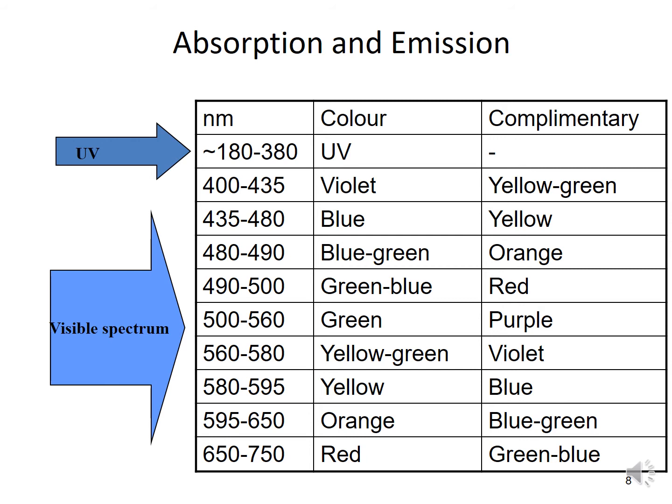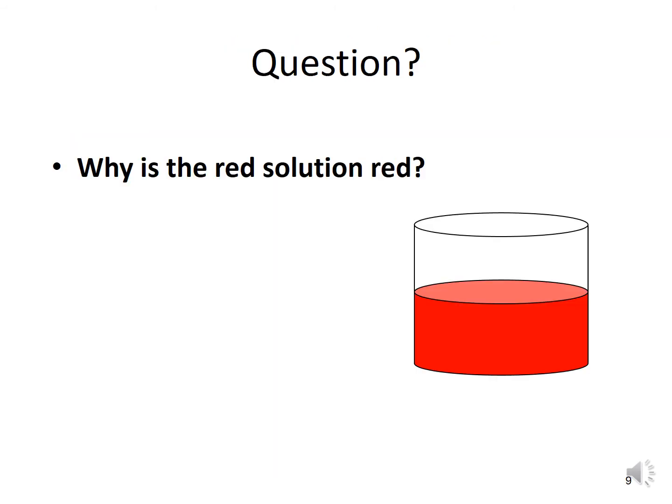and also red. For example, if a chemical reaction occurred and released a red color, it means that the sample absorbed a green blue color from the source of energy.